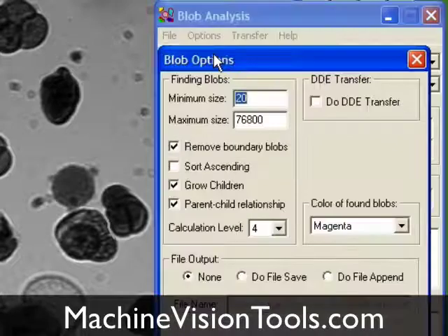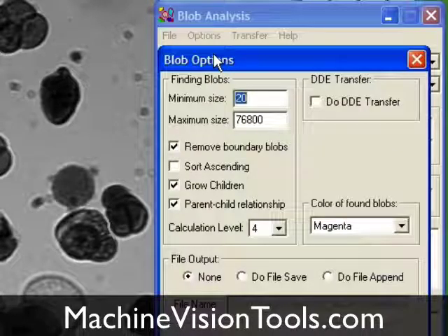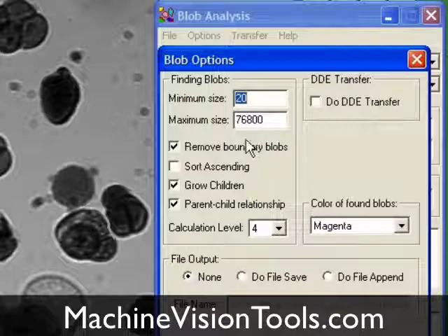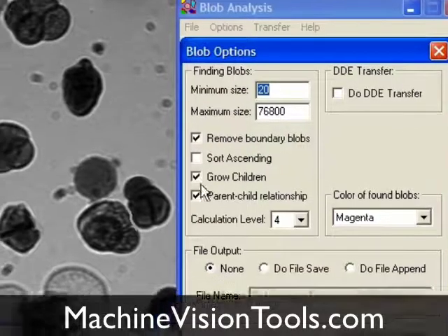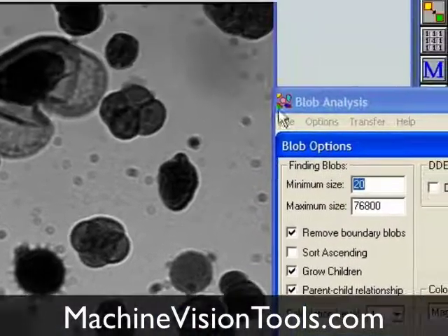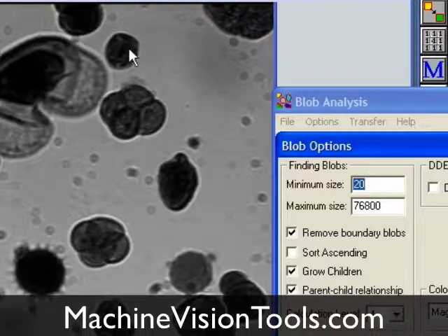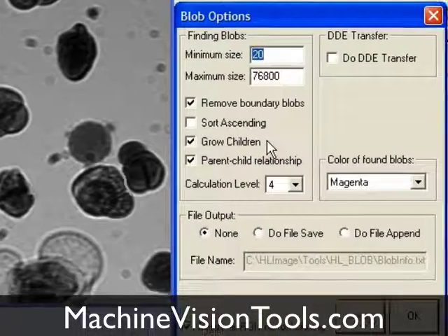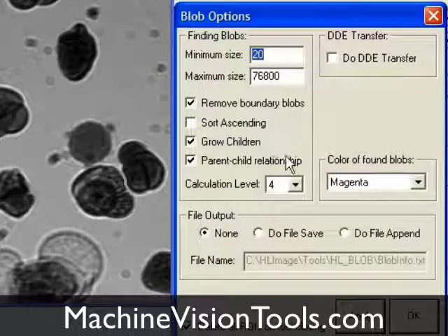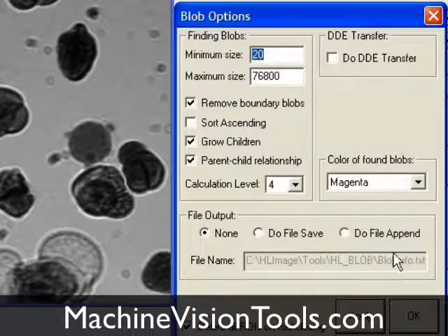Next, we'll open the Blob Options dialog. Here we can select the minimum and maximum size of blobs we want to find. We can indicate whether to find blobs that are touching the boundary of the image or not, and various other options, such as whether to find blobs that are completely contained within another blob.